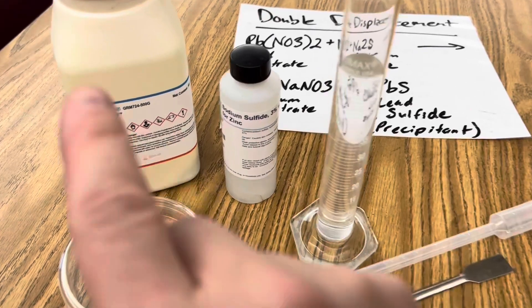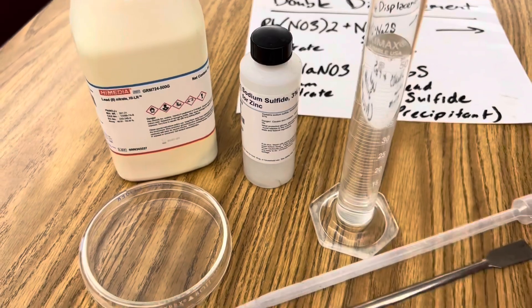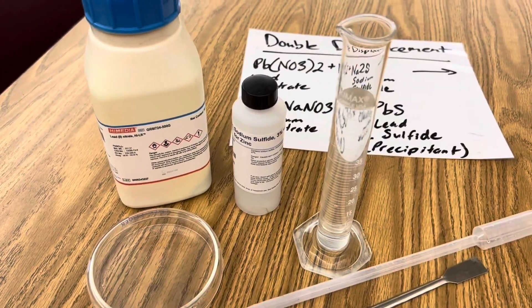All I'm using for this reaction is lead nitrate, sodium sulfide, 50 ml of distilled water, a dropper, a spoon, and a petri dish.